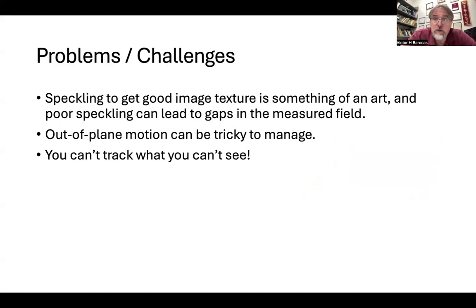Out of plane motion can be very tricky to manage. In this case, it's a tissue sample that's been mounted, but if you're looking at a sample that can move in 3 dimensions, that can be very tricky to manage. We'll talk about that in a moment.